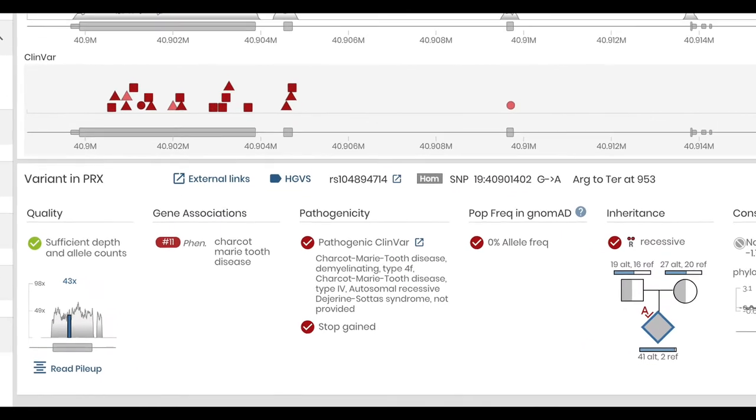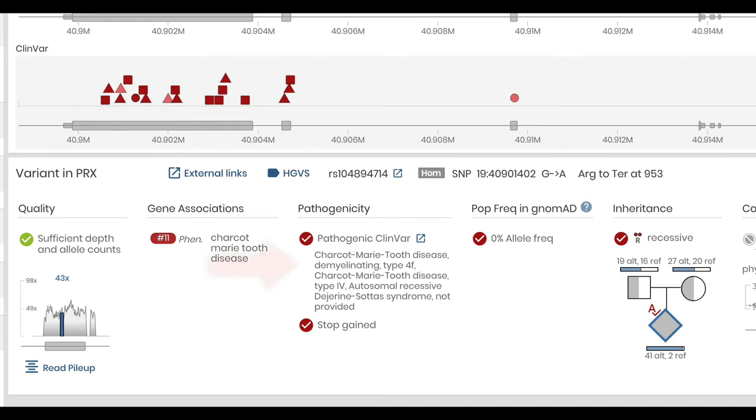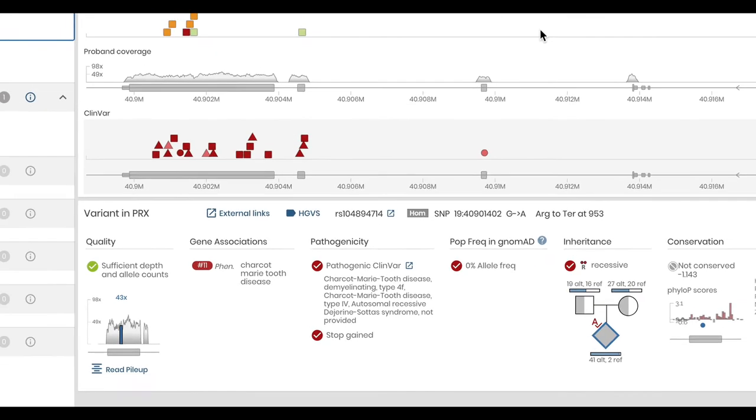This includes allele frequency information from the Nomad and Thousand Genomes projects, the variant's mode of inheritance, presence in the ClinVar database, and the predicted functional impact of the variants, all while you watch.